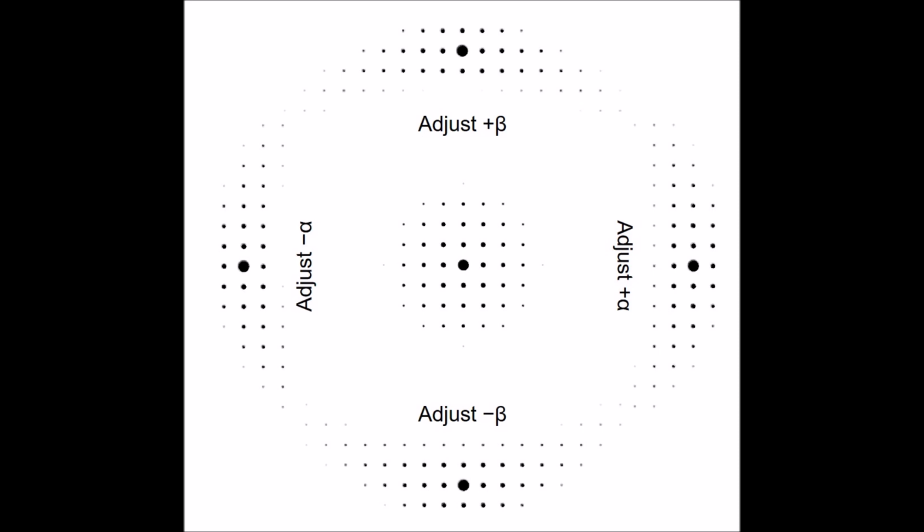So if you look at the finished tilt map that we see right now, and I'm going to show you how I got to this, we will derive this actual tilt map. In the middle, you see 5 diffraction patterns. The one in the middle is the diffraction pattern if the zone axis alignment was perfect. This is a simulated diffraction pattern for just a cubic, I believe, simple cubic crystal. That would be another video, of course, how to do these simulations, but for now, just try not to worry about that. Right in the middle, that's obviously perfect zone axis alignment.